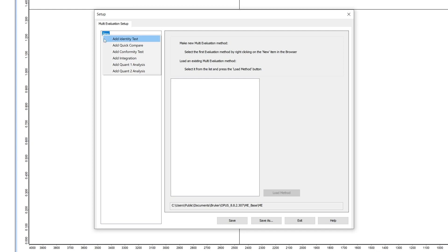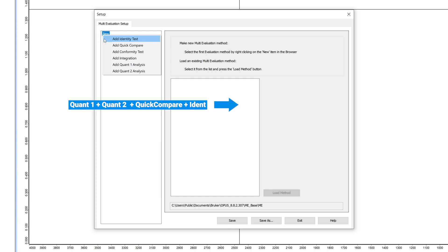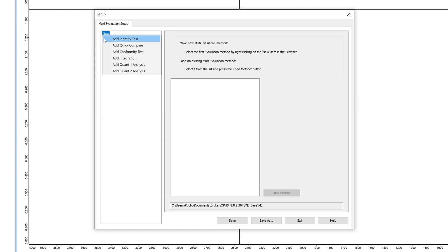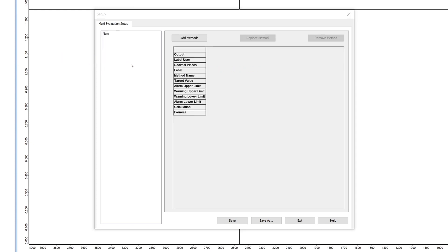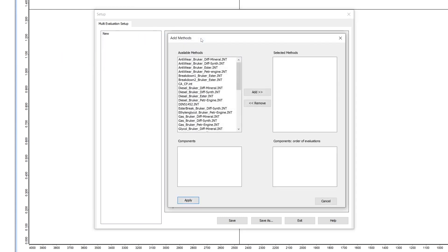You can combine multiple different methods such as quant 1, 2, quick compare or IDENT into one single MEV file. In this example we will work with multiple integration methods, so we left click on add integration and afterwards on add methods.